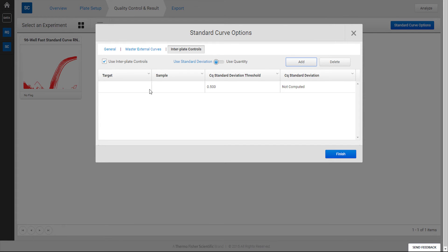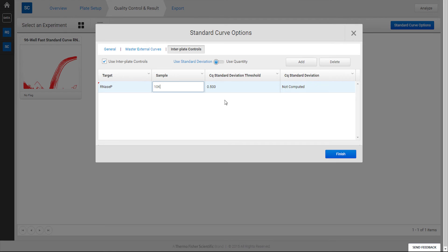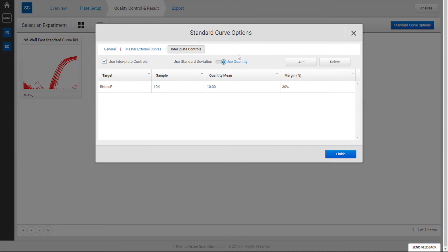Typically, one will select a sample with a known result and identify by target and sample name. There are two methods of checking: the first method is to define a quantity and set a desired variance from the quantity. The second is to set a desired standard deviation between the replicates across the plates in the project.